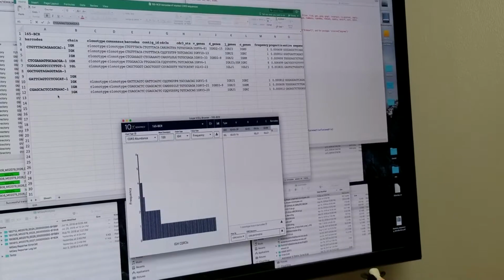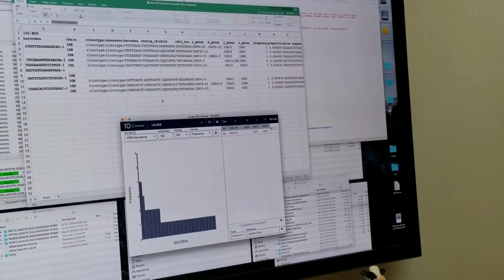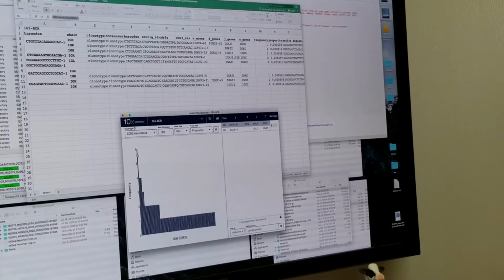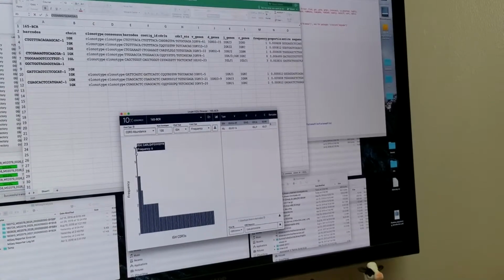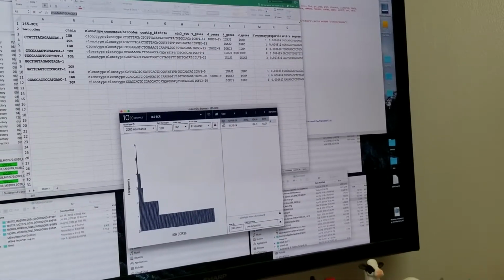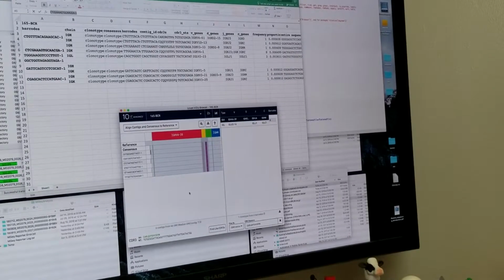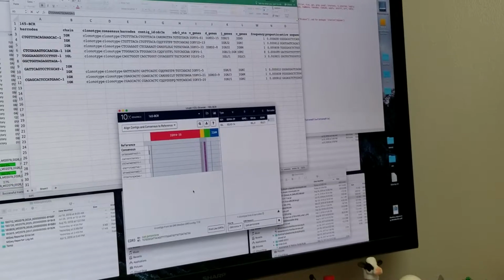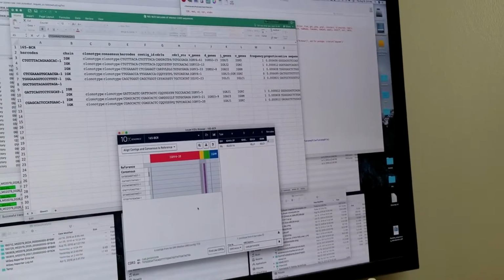So they're very rare, so we may not want to get that one. If we had our druthers, we could pick one that has at least 2. Can you look at that one, this 6 one? Yeah, the BAM file for that. So here's the heavy chain, and here's all 6 of those that we're seeing. Oh, all 6. Okay.